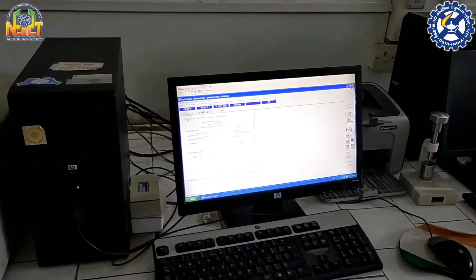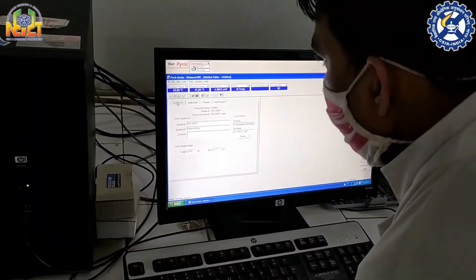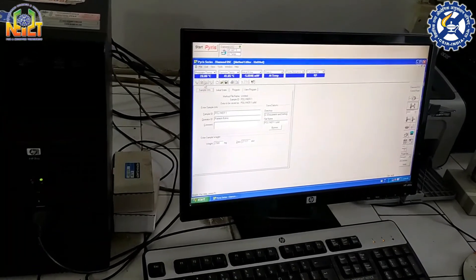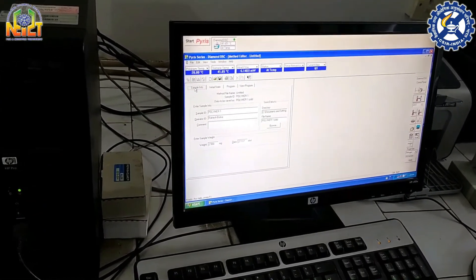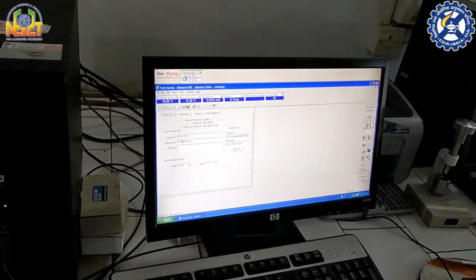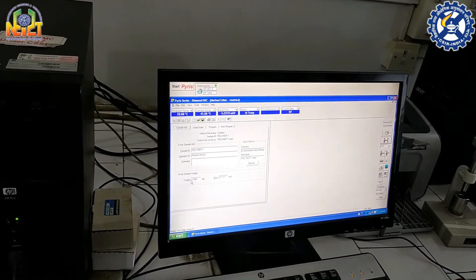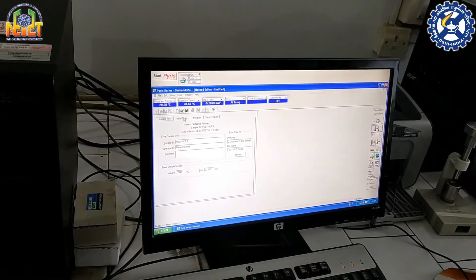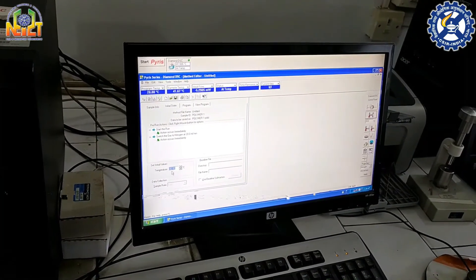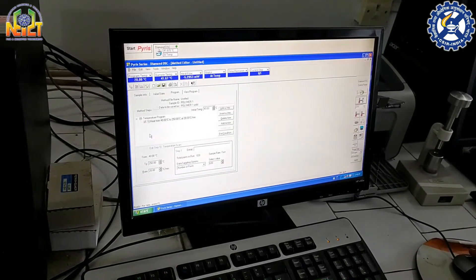Now I am going to the software of this instrument. I am filling in information about our polymer sample. Sample ID is 'polymer', weight of this polymer sample is 2.5 milligrams, and the initial temperature is 40 degrees centigrade.